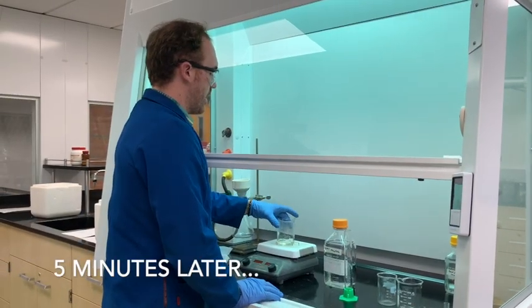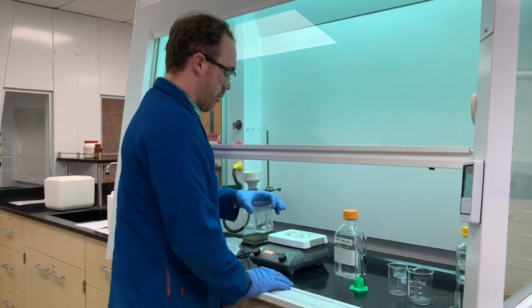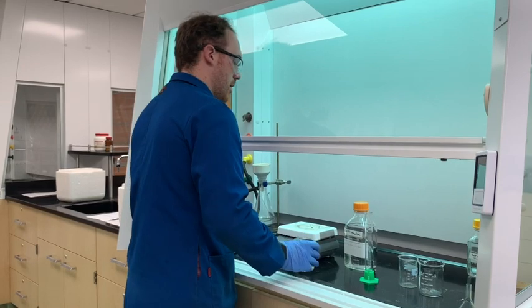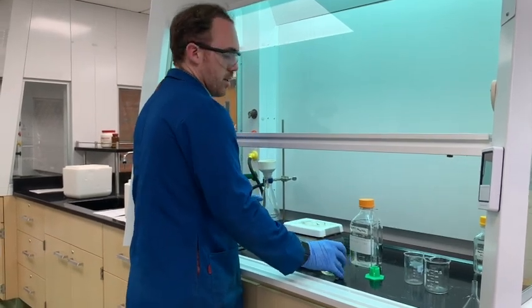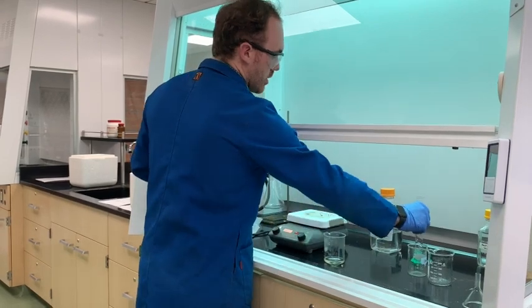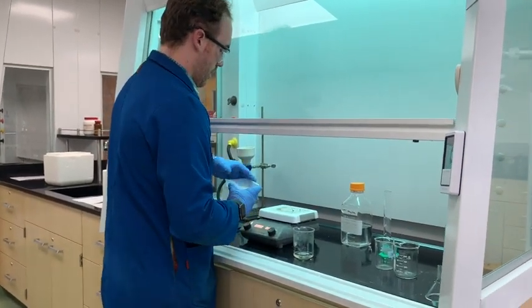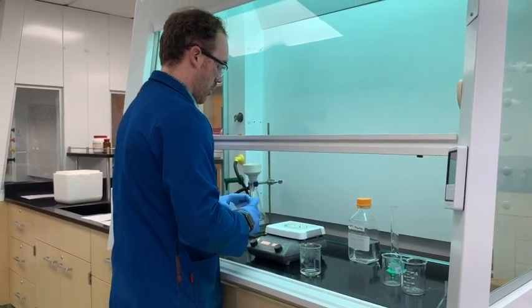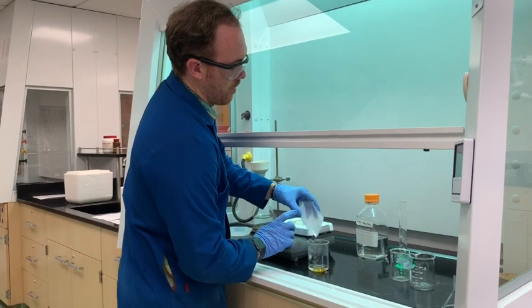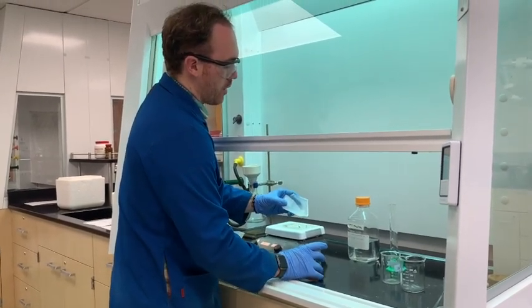Alright, so we've let this heat up to dissolve, and it's a little warmer than room temperature, so it's probably fine to add the sodium nitrite. So I'm going to carefully place this right here on the bench, make sure I have some clear space, and just add the sodium nitrite slowly. You want to make sure that you get as much of it in there as you can. Try not to waste any of it. And right as soon as you add it, it turns a deep brown color.